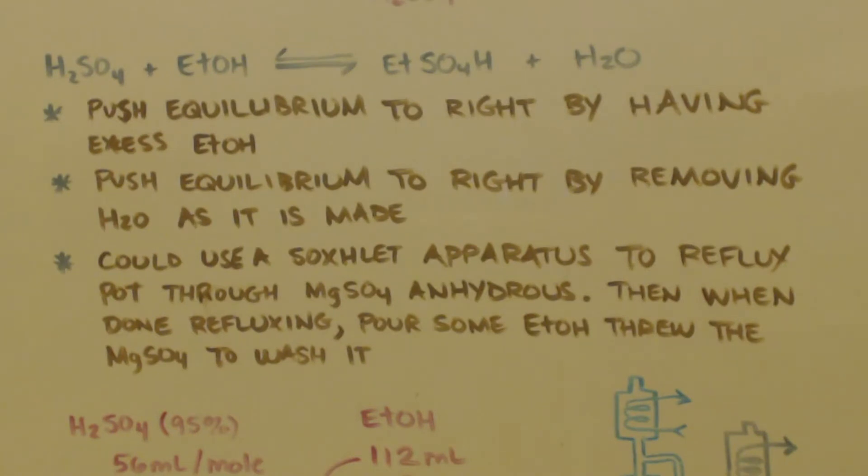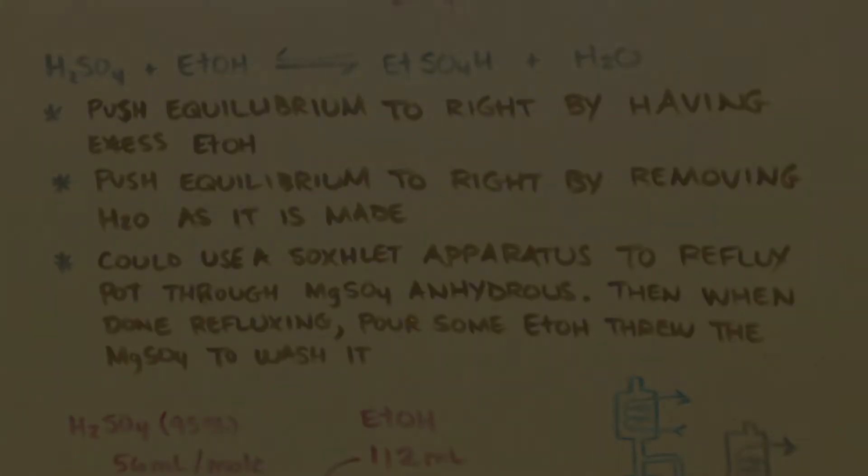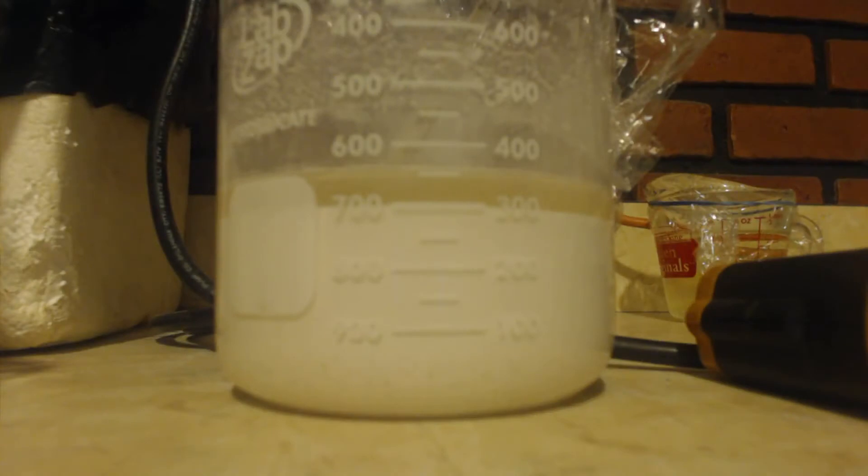And the reason I'm not going to do it, but what you could do is put this in a Soxhlet apparatus and reflux it so that the pot is refluxed through magnesium sulfate that's anhydrous. Then when you're done refluxing, pour a little bit more ethanol through the magnesium sulfate to wash out any product that's in there.